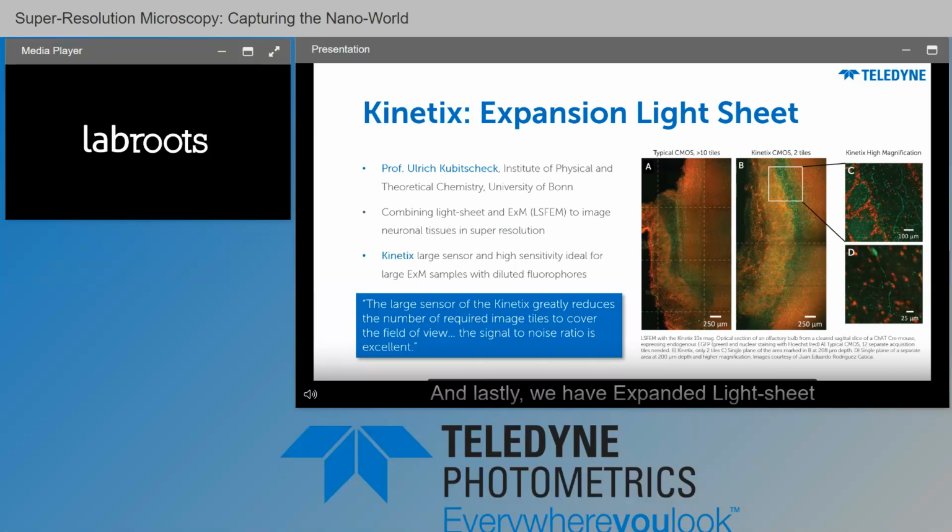And lastly, we have expanded light sheet with Professor Ulrich Kubitschek. He is combining light sheet microscopy and expansion microscopy to image neuronal tissues in super resolution. He's also put together this comparison for us.